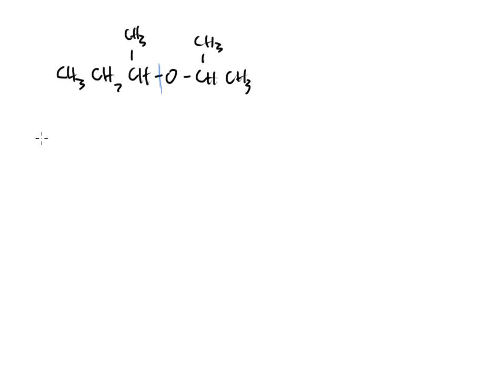When it does that, what I have is a CH3, CH2, CH with a CH3, and then I have this oxygen piece with these 3 carbons on it. If that bond breaks, these are my 2 options.